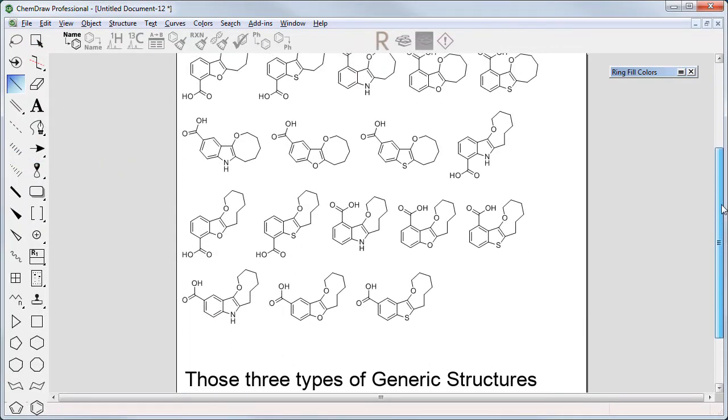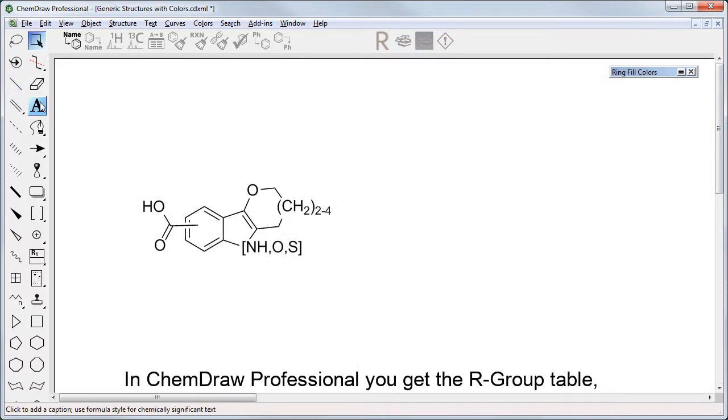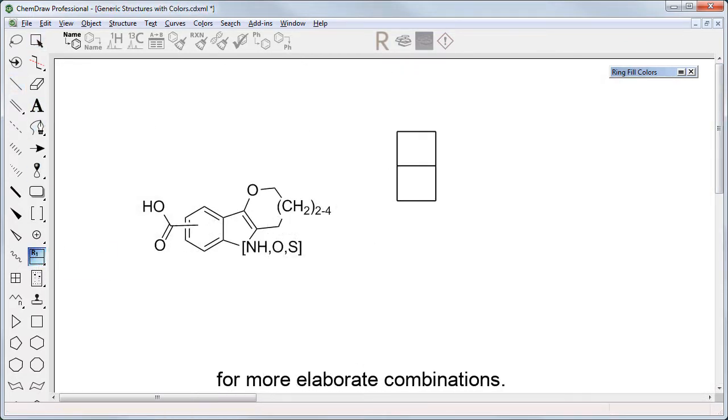Those three types of generic structures are available in ChemDraw Prime. In ChemDraw Professional, you get the R group table for more elaborate combinations.